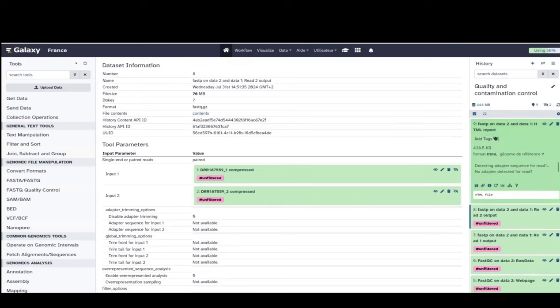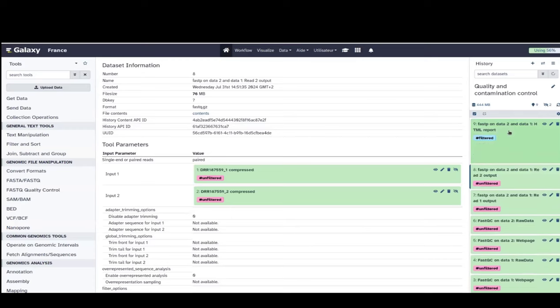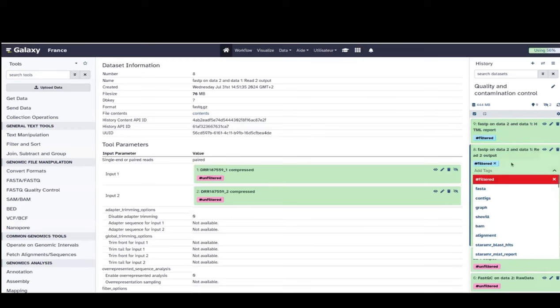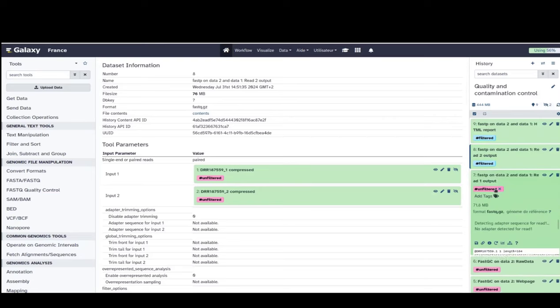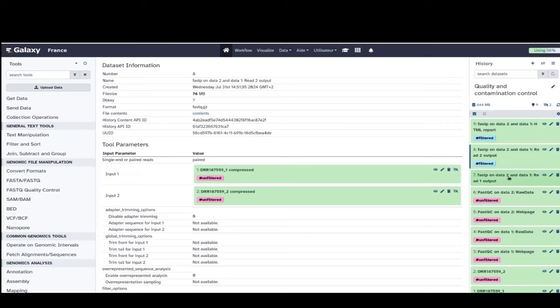Now we will remove the 'unfiltered' tag on the FastP outputs and put a new tag 'filtered'. We just need to remove the old tag and apply the new one for each output. Now you can see that the FastQC outputs have the 'unfiltered' tag, and the FastP outputs have the 'filtered' tag.